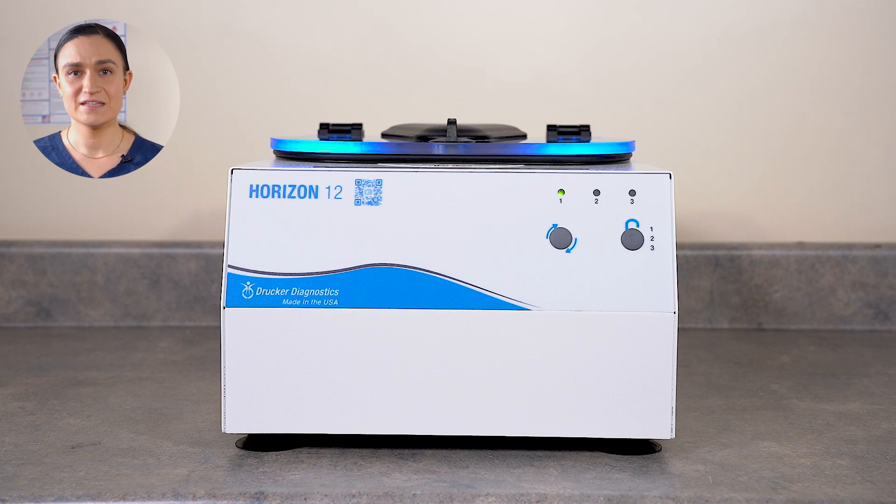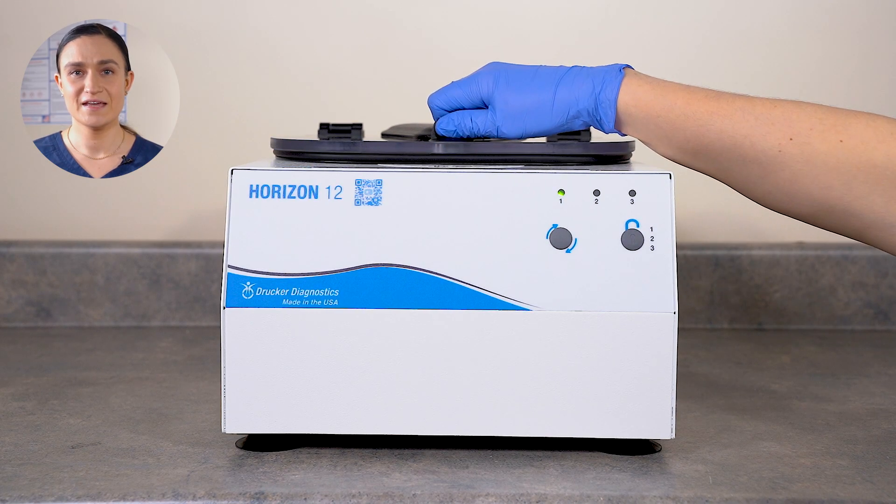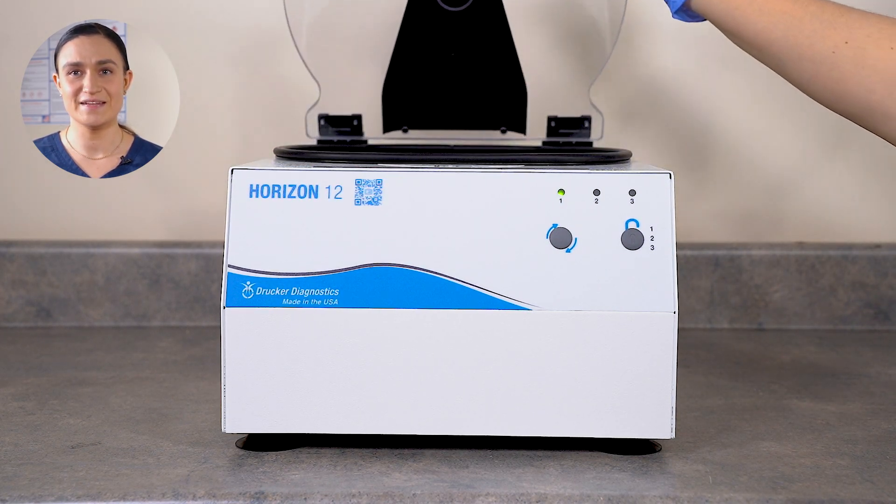Once the run is complete, the centrifuge will begin to slow down. When the rotor is fully stopped, the centrifuge will beep and the lid lights will flash to let you know it's done. The centrifuge will automatically unlock. Turn the lid latch a quarter turn counterclockwise and then lift the lid to retrieve your spun samples.